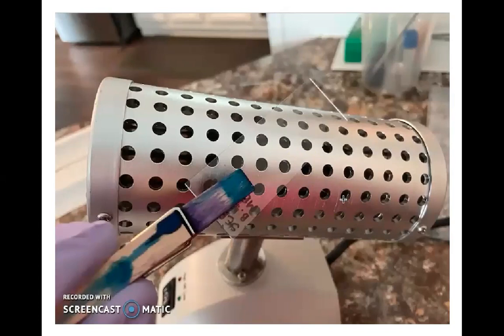So make sure the slide is 100% dry, and then pick the slide up, preferably with a clothespin. And this is the clothespin I showed you at the beginning of the video this morning. The clothespin will allow me to hold this slide against the hot aluminum surface of my incinerator and keep my fingers far away. So you simply lay the glass slide right to the surface of that incinerator and leave it there for approximately 20 to 30 seconds.